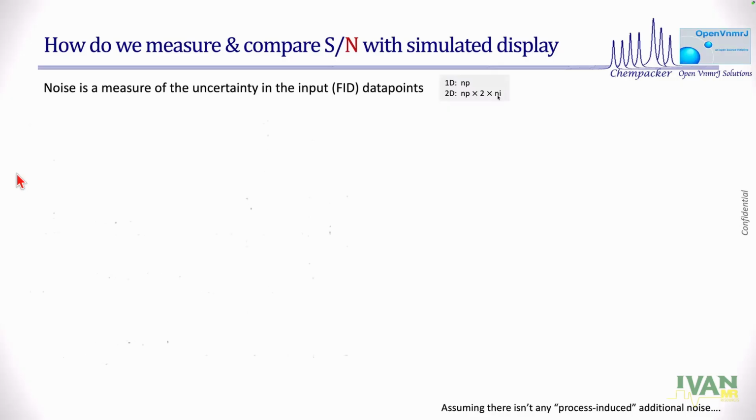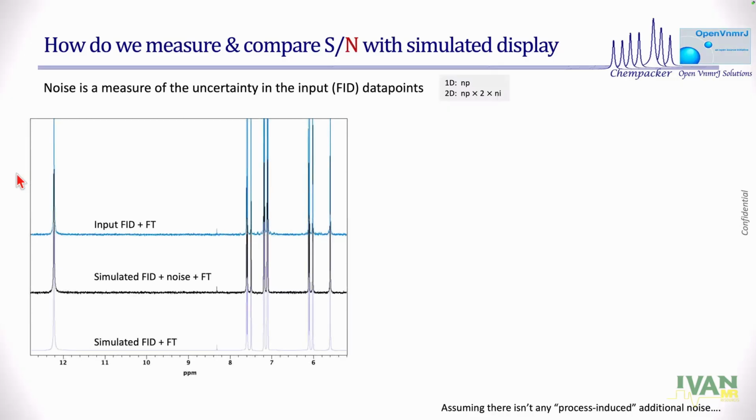In the spectrum too, I can simulate, obviously with no noise, but I can measure the noise level in the spectrum and then go back and muck with every one of the data points in the 1D, 32,000, 64,000, simulated. So there is no uncertainty here, it's simulated. Then we say, okay, at each one of them, insert this noise. And then we can transform that. This is a simulated FID, but I added the same amount of noise that I measured from the spectrum.